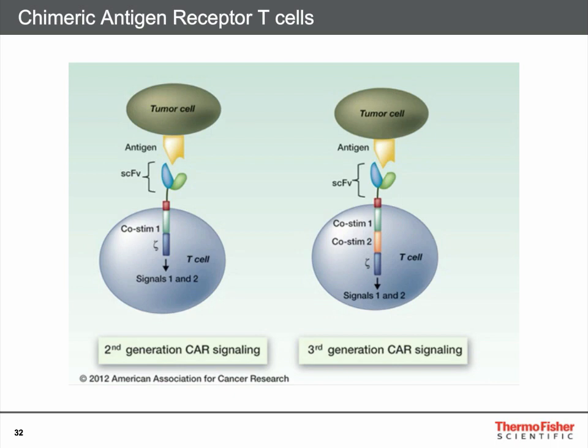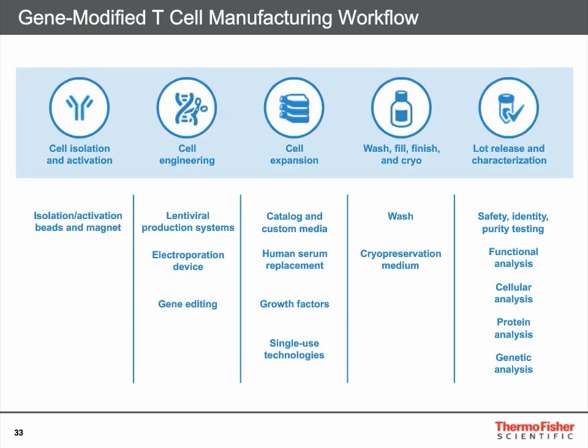So because in this case, the cell is the drug, we need cell-based assays for the entire process of interrogating the performance and development and efficacy of this drug, which is a cell.